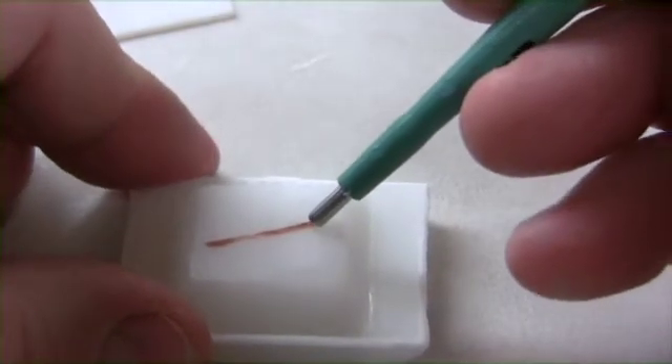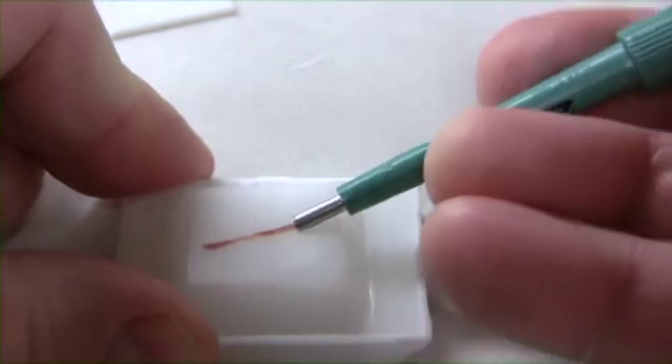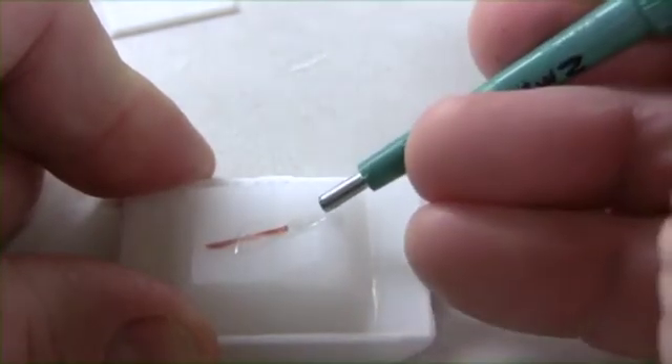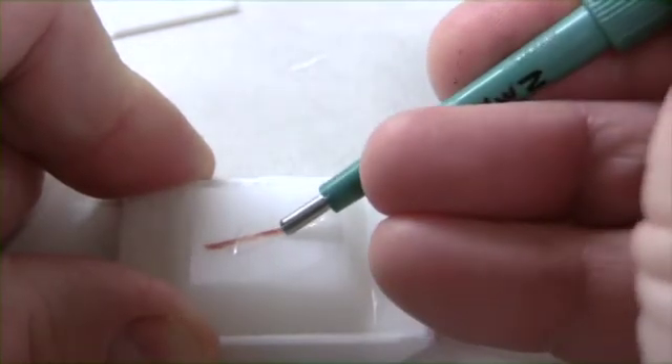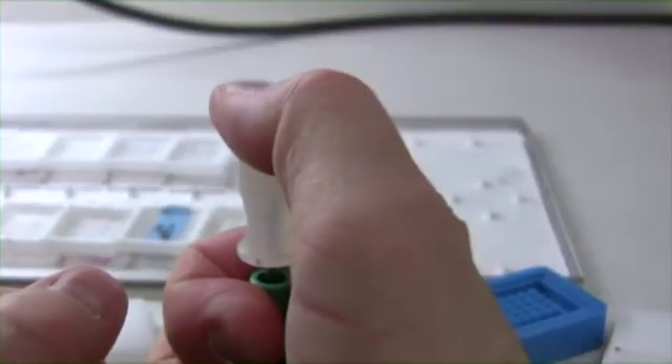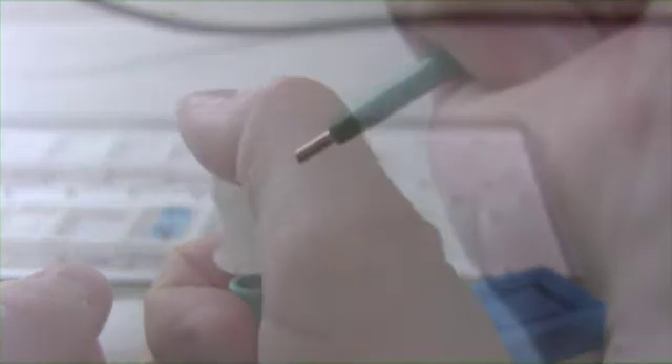In the past, technicians would do a double or triple punch to fill a needle. This type of technique creates sporadic tissue throughout the core. When that TMA is cut, these cores will pop out causing blank spots in the TMA. It's best to fill the needle then pack it. This will create a solid core, also called a sausage core.